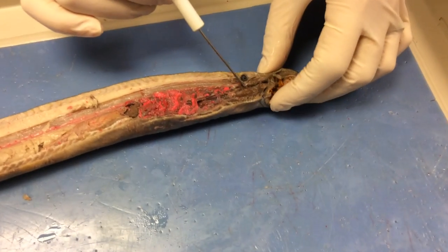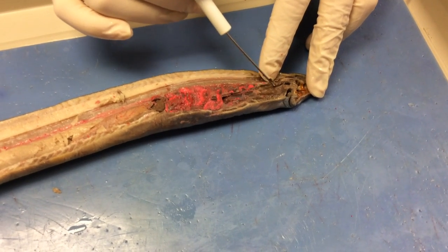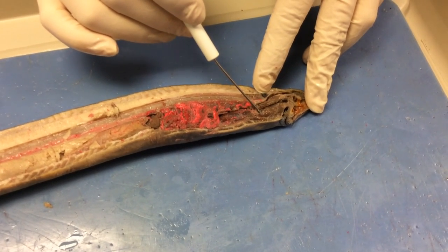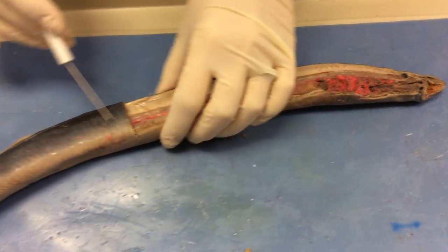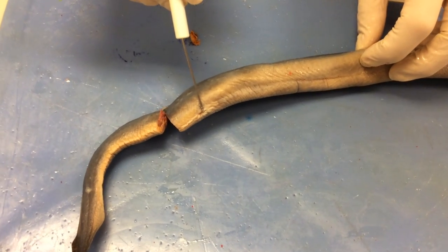In this region up towards the front, this structure that I'm pointing at right here, I know it's kind of hard to see because there's not a massive color variation. You can see some of it here. This is all cartilage, and this is part of the lingual cartilage, where ling means tongue. Okay, as we move further down, you'll be able to note the cloaca, where everything is going to exit.